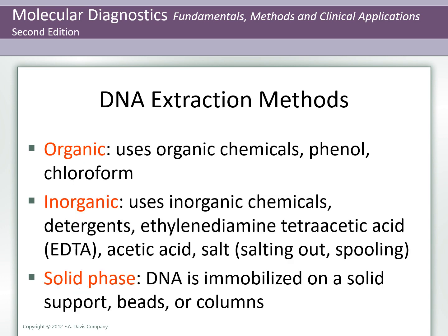After the release of DNA from the cell, further purification requires removal of contaminating proteins, lipids, carbohydrates, and cell debris. There are different DNA extraction methods. Organic extraction methods use a combination of high salt, low pH, and an organic mixture of phenol and chloroform. Inorganic methods do not require phenol extraction and were developed due to safety concerns with the caustic reagents such as phenol that make it a less desirable method.